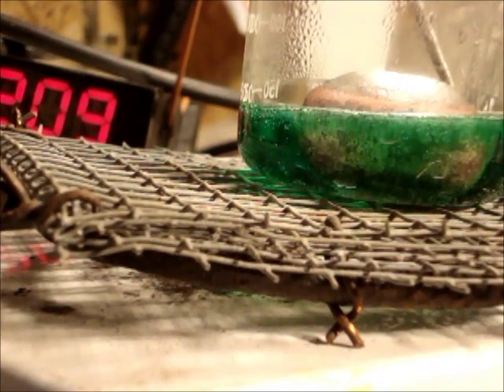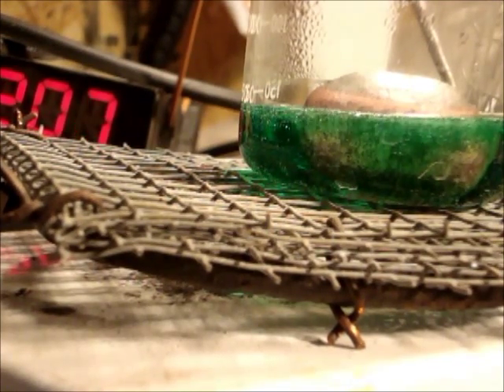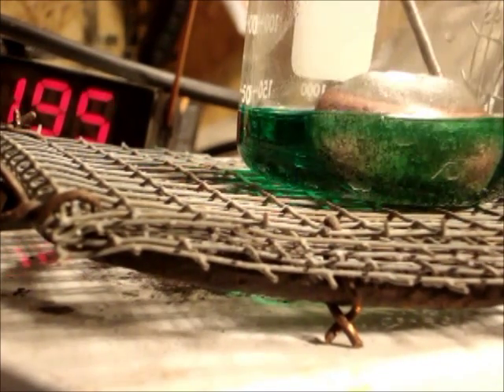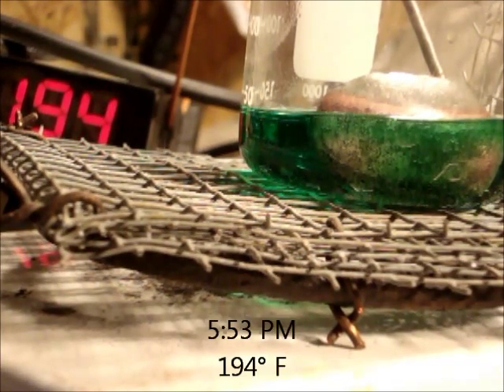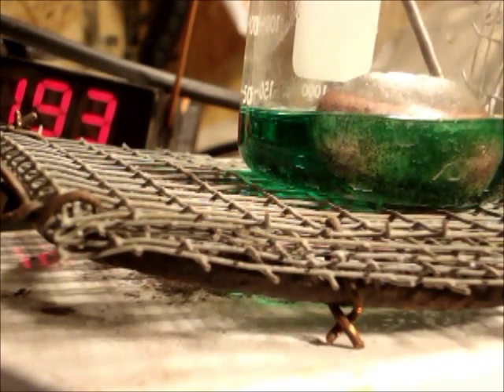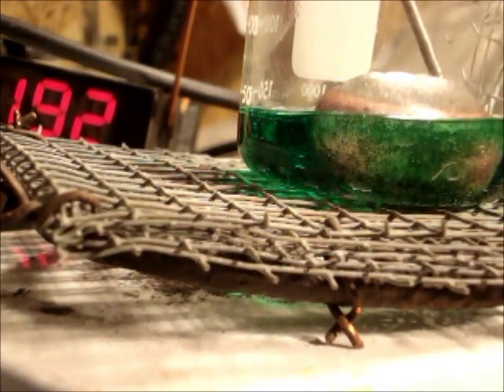Okay, I took the beaker off the hot plate and we're going to put it on top of some gauze. You can see the temperature is now 208, 207, 206. It's falling. And the bubbling is still continuing, but only slightly. Okay, it's 5:53, temperature now at 194, and the bubbling is almost stopped, indicating you got to get that temperature up to at least a couple hundred degrees, as you well know, to get the nickel nitrate reaction going.